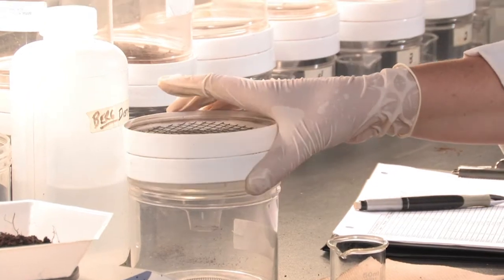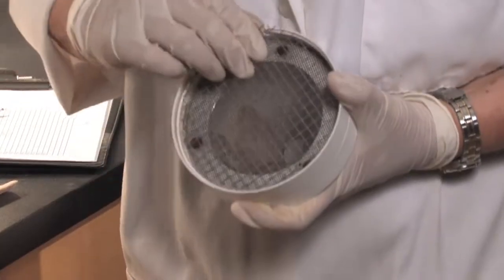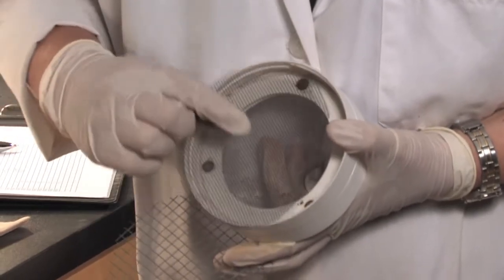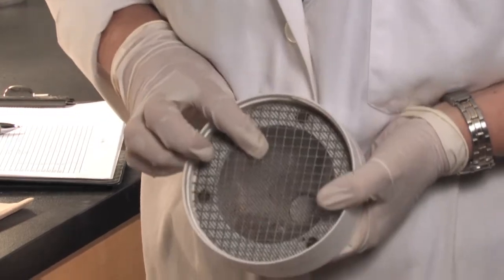We take the top of the microarthropod extractor. As you can see, we have two types of mesh — one is quite small and the other one a little bit larger. This will hold the soil sample.